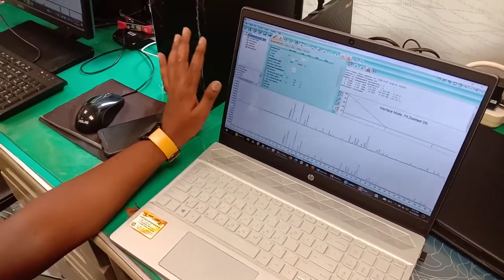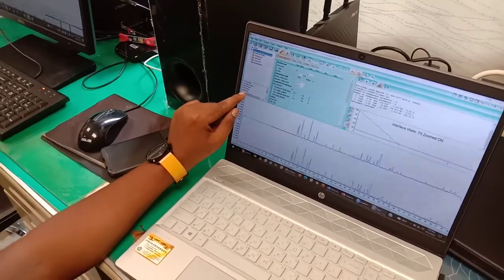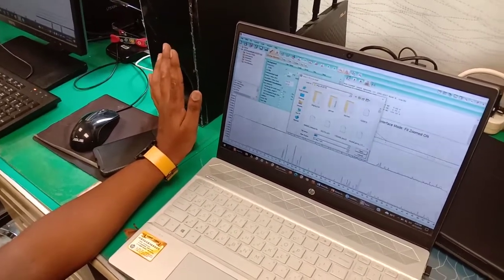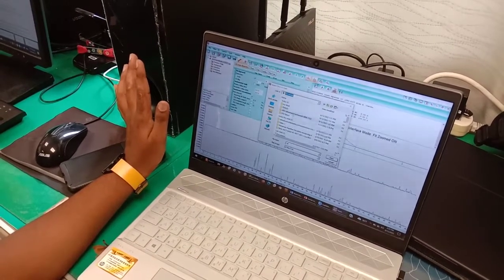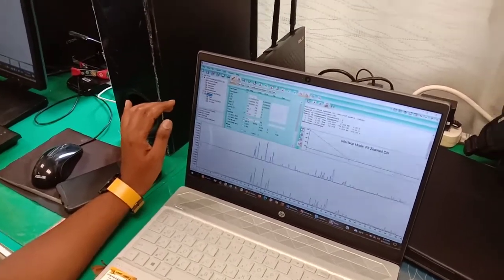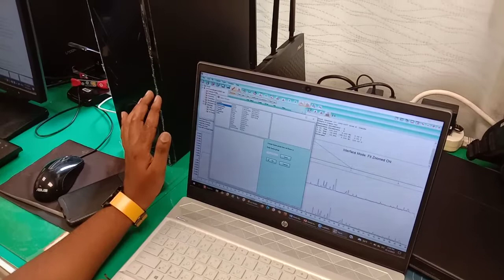Then you have to choose the CIF file. We just select this one. We select your XRD file. Then you can choose load CIF here, or maybe right click and choose CIF. Okay. Then choose the file. Here it's gallium oxide. Okay, you choose the file. Then here you can see that sometimes if you load the CIF, you see no space group. So you have to choose the space group.